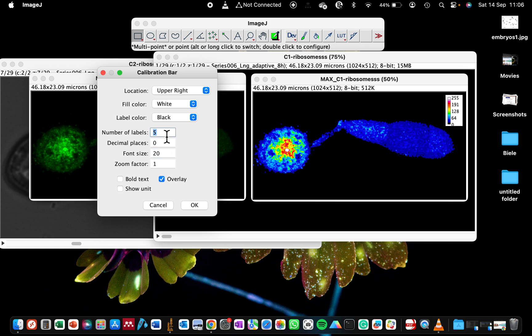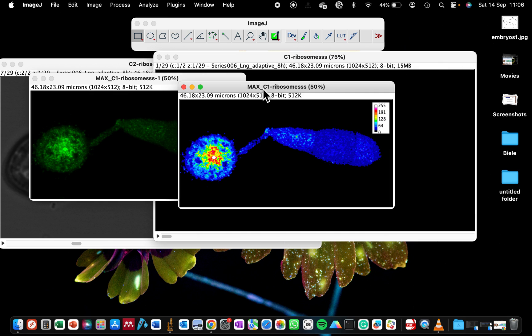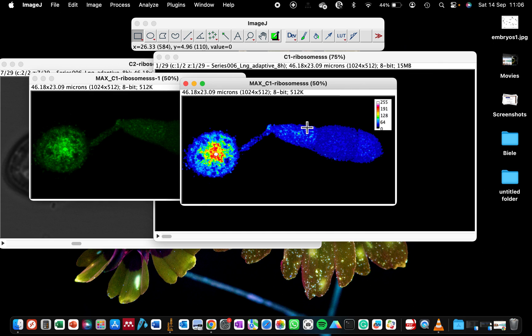You can decide on the number of labels that you want the scale bar to show. If you want it to show just two, which is the maximum and the minimum, then you change it to two. But usually five is good because it shows you the middle number as well. Now we say okay and this particular scale bar has been engraved into this image.